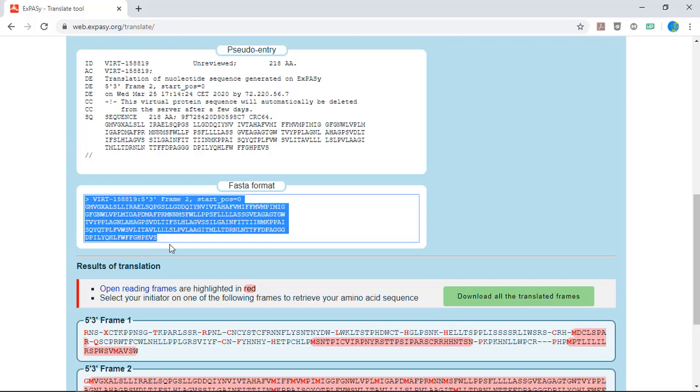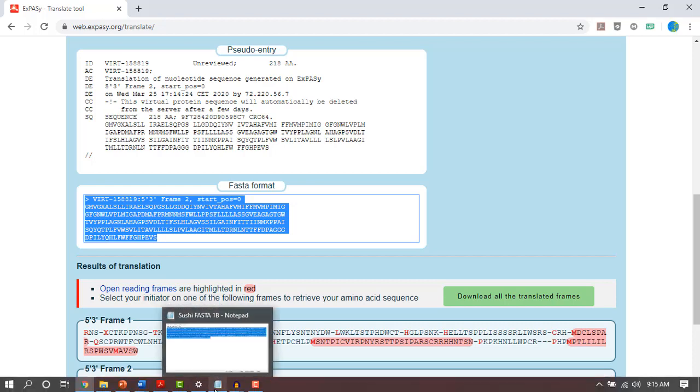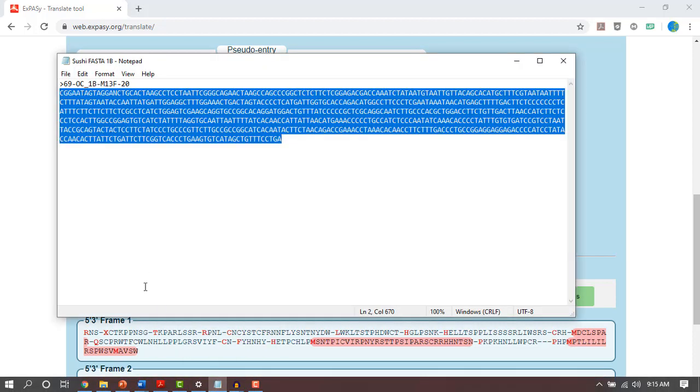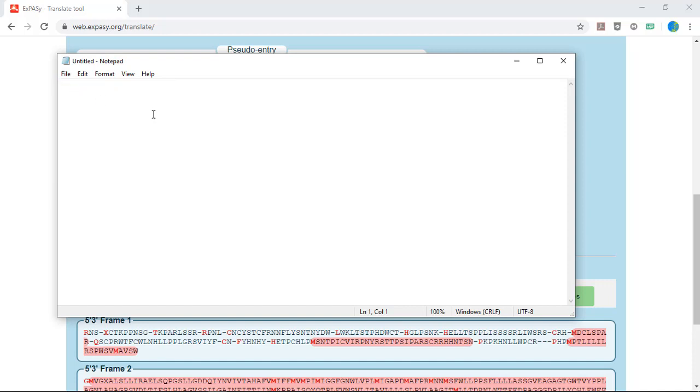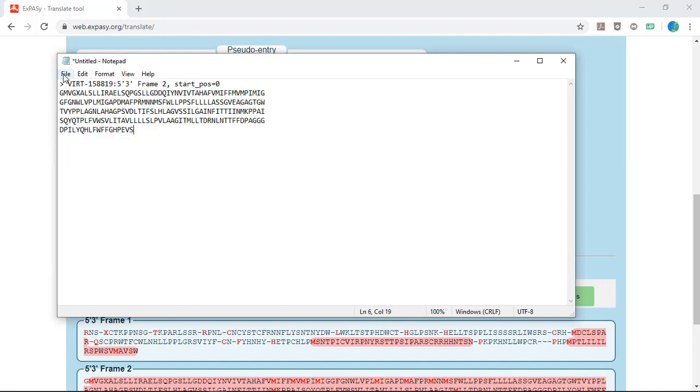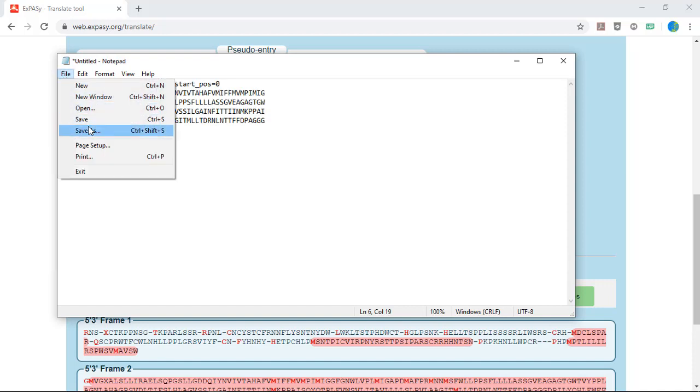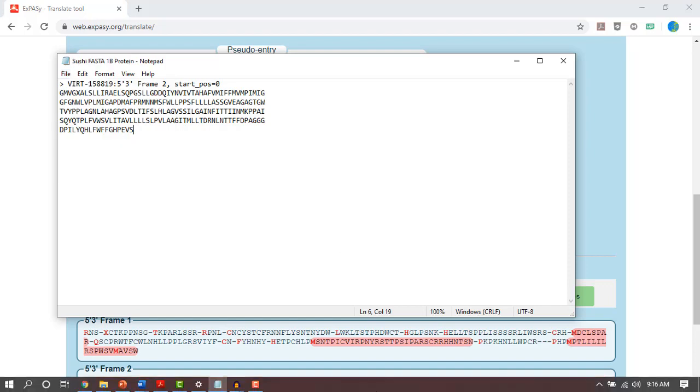Copy and paste that amino acid sequence to a new text file on your computer using Notepad or a similar text editing program. And save it to your computer. Now you're ready to move on to the rest of the analysis.